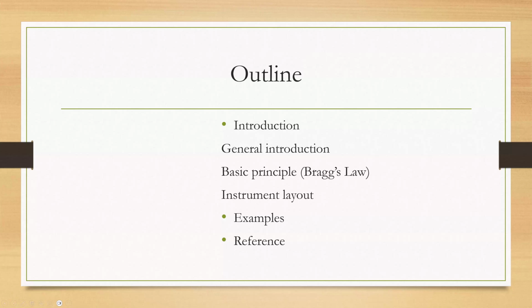Here is the outline of my talk. I will start with the general introduction of powder XRD, then discuss the basic principle, namely Bragg's law. Next, I will show you the instrument layout, including the major components needed for powder diffraction. After that, I will present two examples that highlight powder XRD's capabilities in identifying phases and monitoring structural changes. Finally, I will show some references for powder XRD.